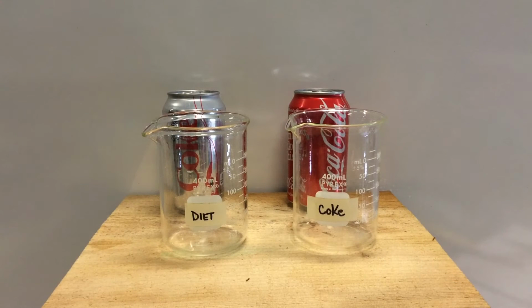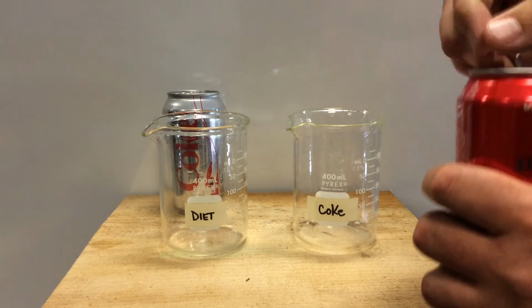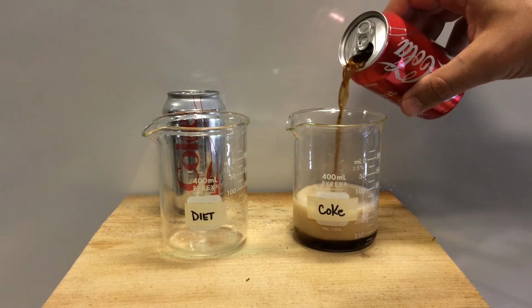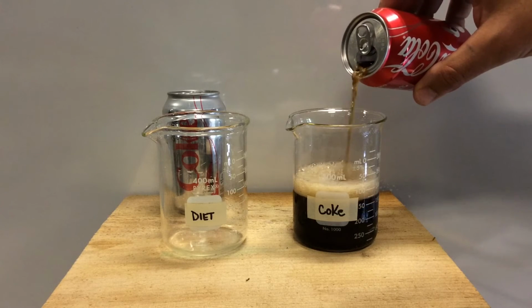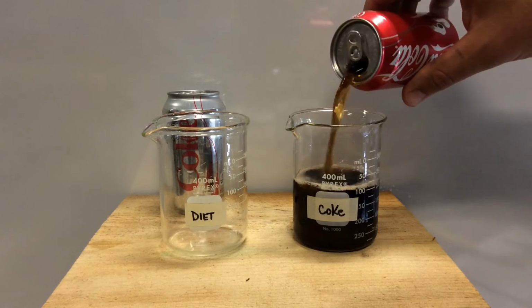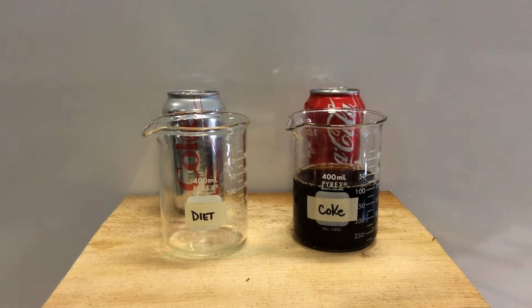So before we can determine the density, we're going to have to measure mass and volume, obviously. So let's begin by getting some regular Coke and Diet Coke in here. And the one thing I want you to realize, we have a problem initially in this lab, is that we're going to have that carbonation. We're going to have gas that's dissolved in the liquid, and that could cause some problems for us. So what's really helpful in this lab is to let the Coke and Diet Coke go flat.